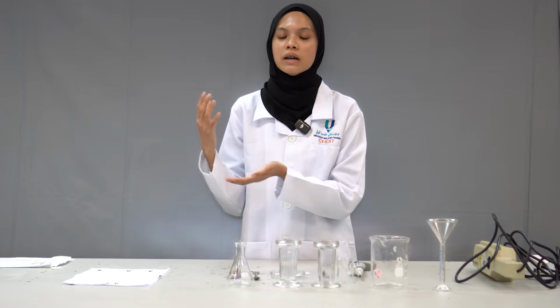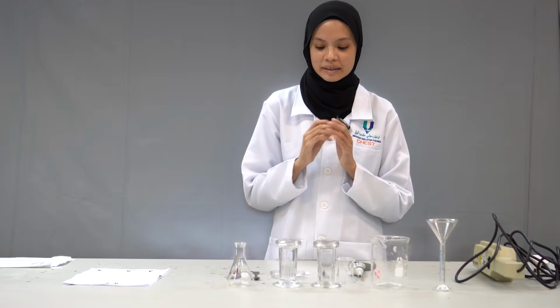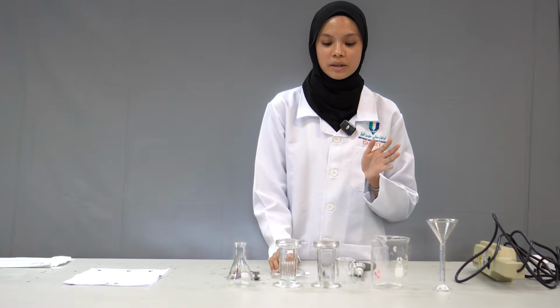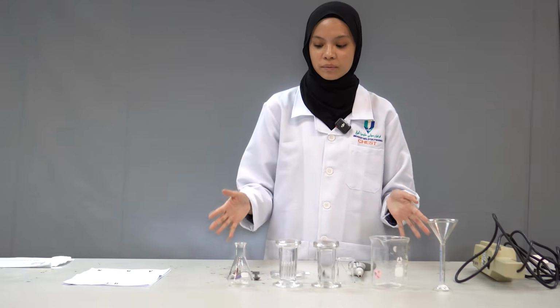Choosing the optimum solvent is a challenge because different solvents have different polarity, and the polarity affects the interaction between the plate and the molecular compound. So the polarity of the solvents plays the critical role in this thin layer chromatography experiment.